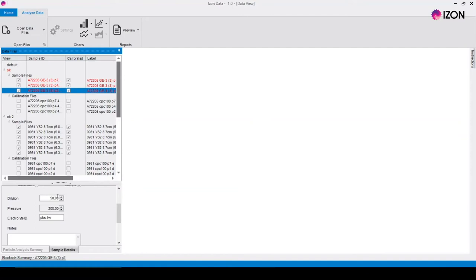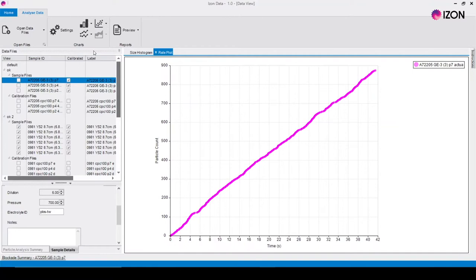To view various plots of the data click on the drop down menu and select the plots you would like displayed. To display all of the options click on the corresponding icon as shown here.